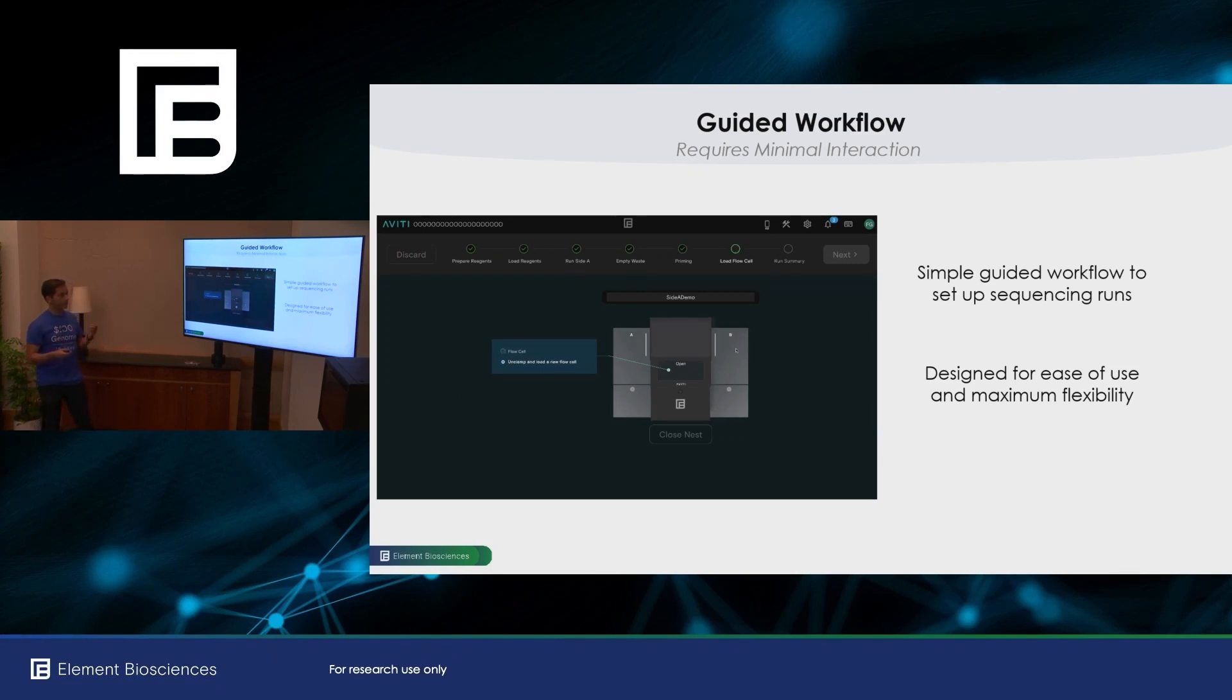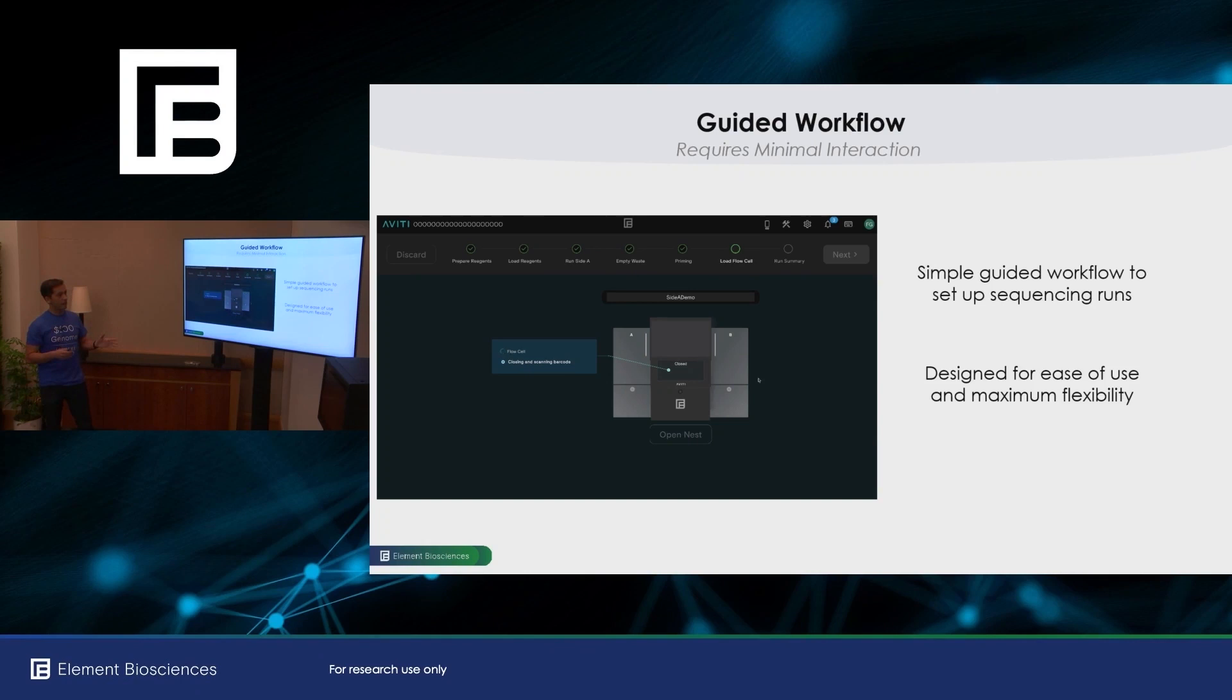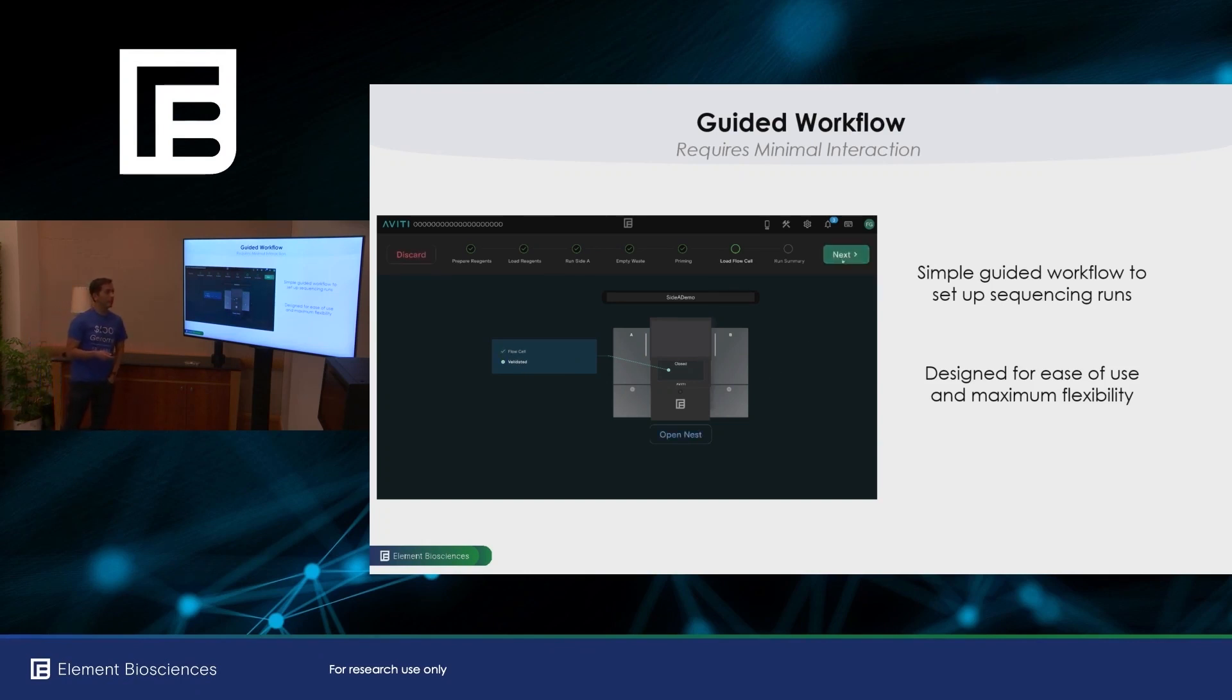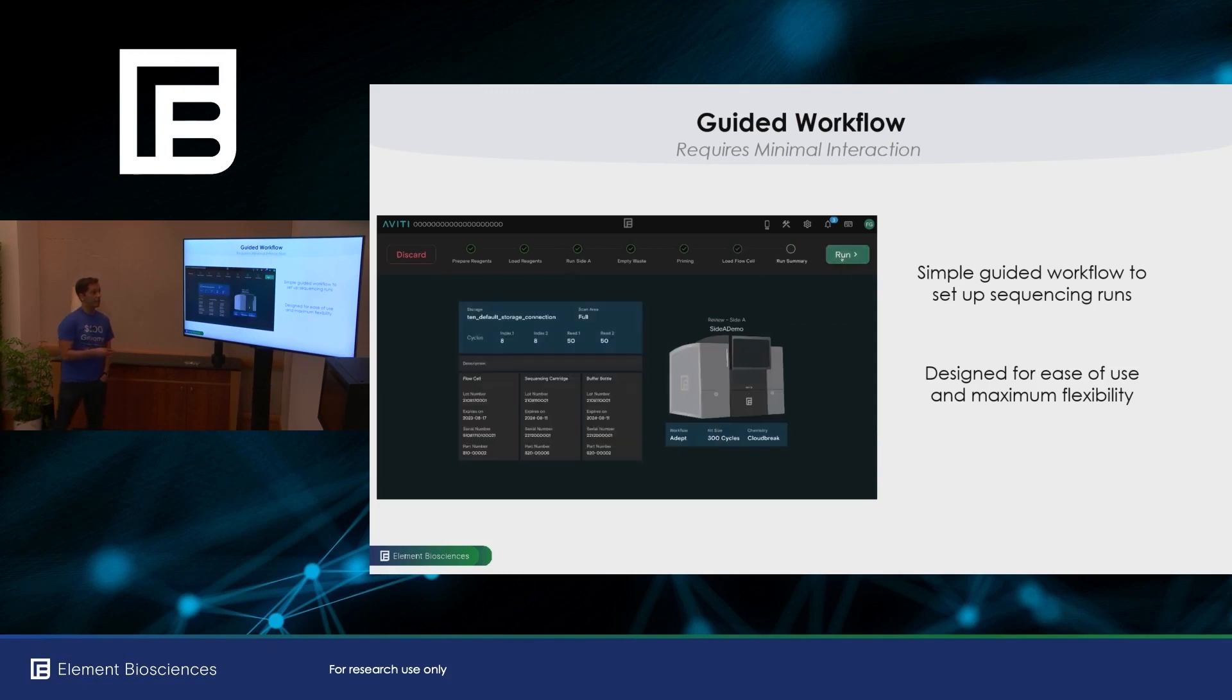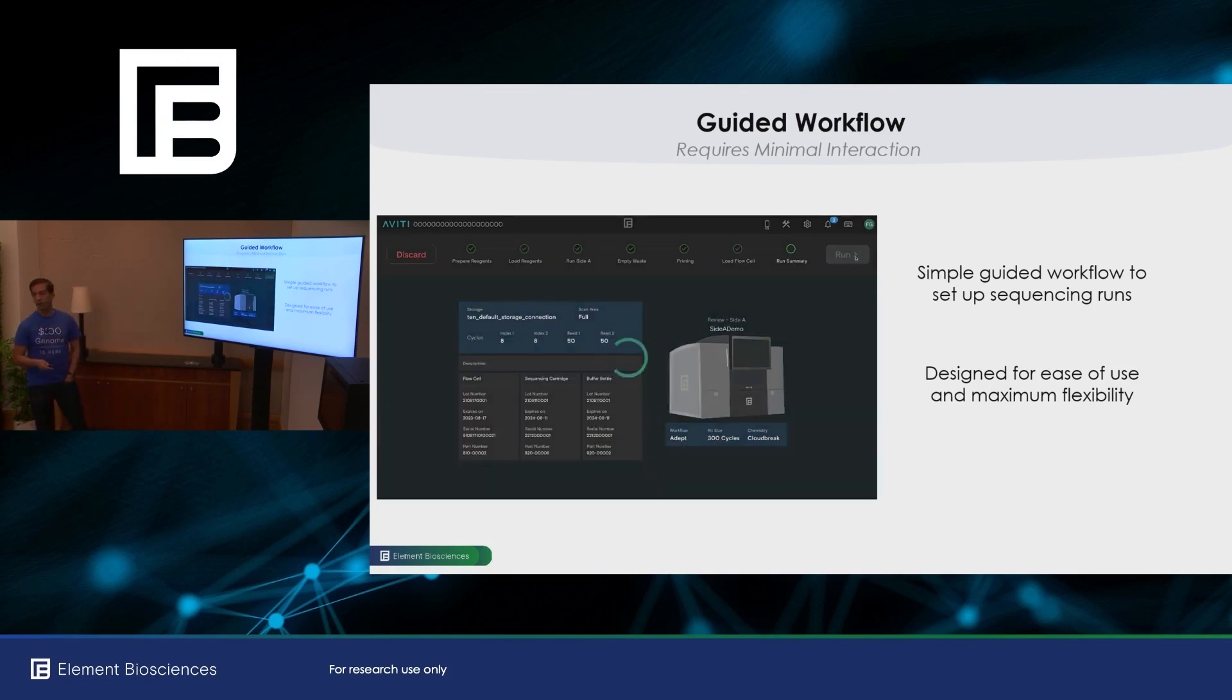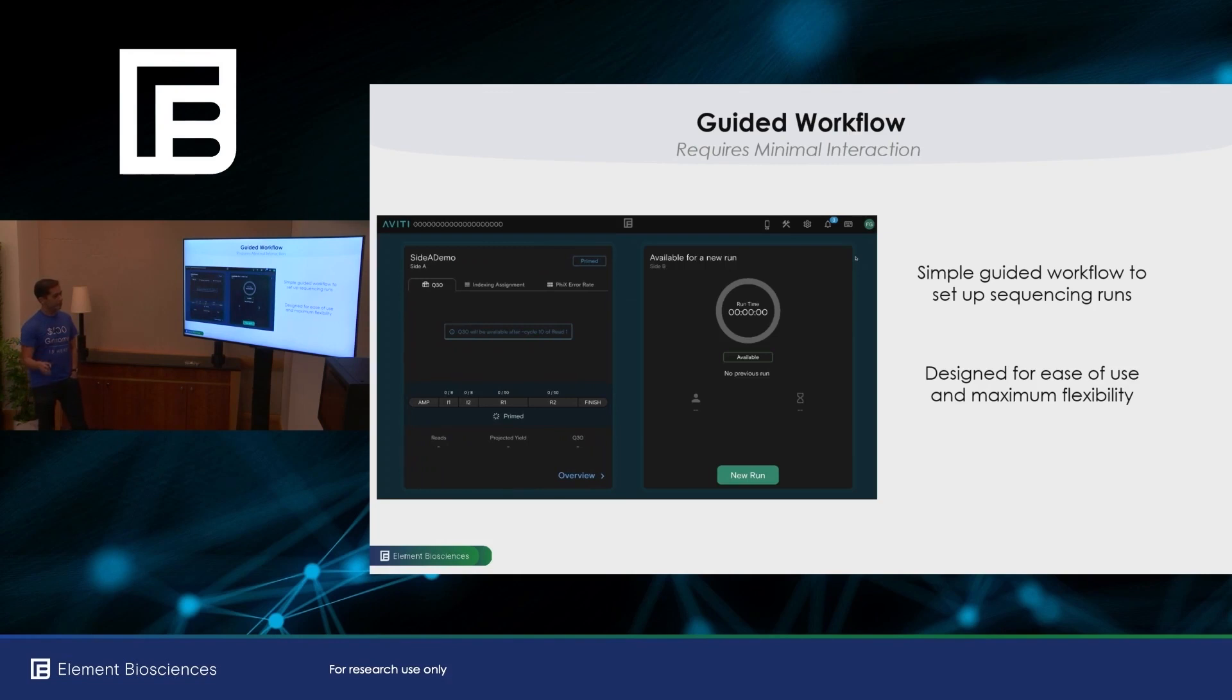And then you load your flow cell. Here you unclamp the flow cell. You load the old flow cell. You load a new flow cell. The barcode is scanned. It's verified against the reagents you've already loaded. And you get to the run summary screen where you get to review all the information before you start your run. So it's very simple.